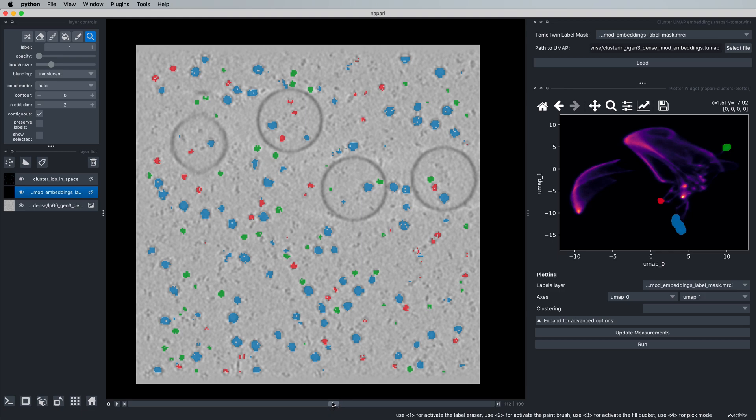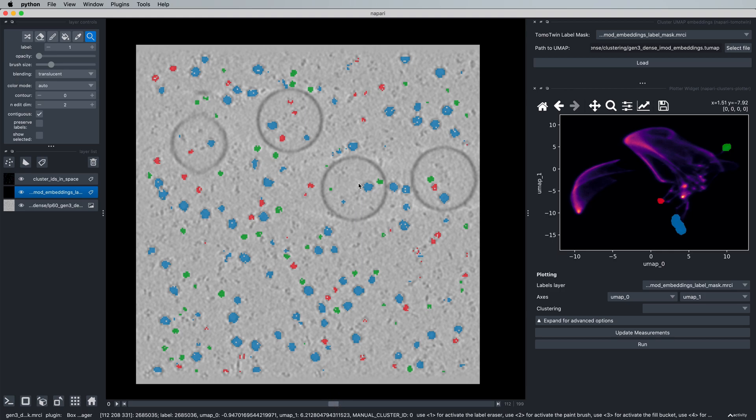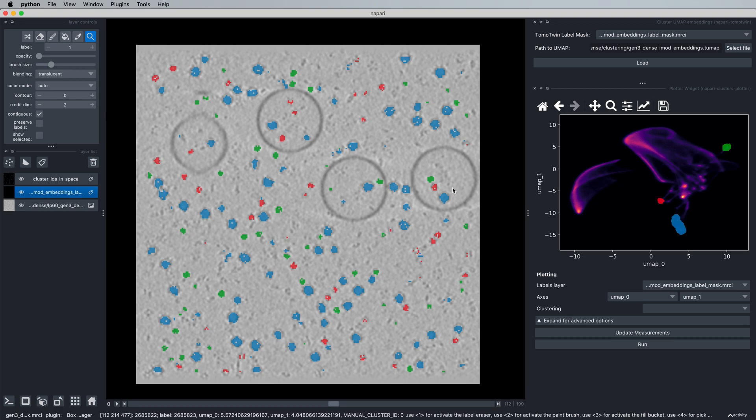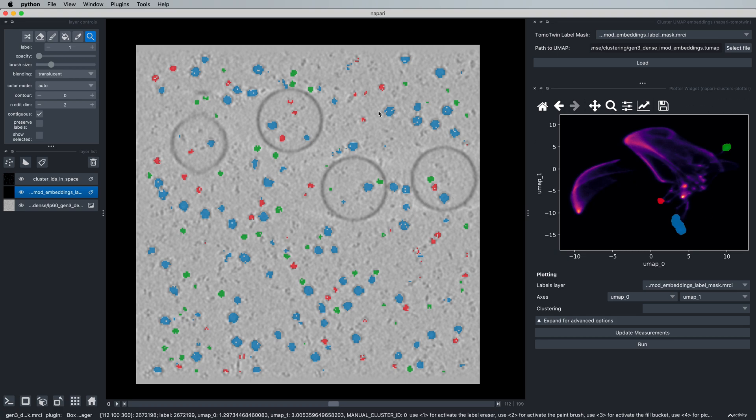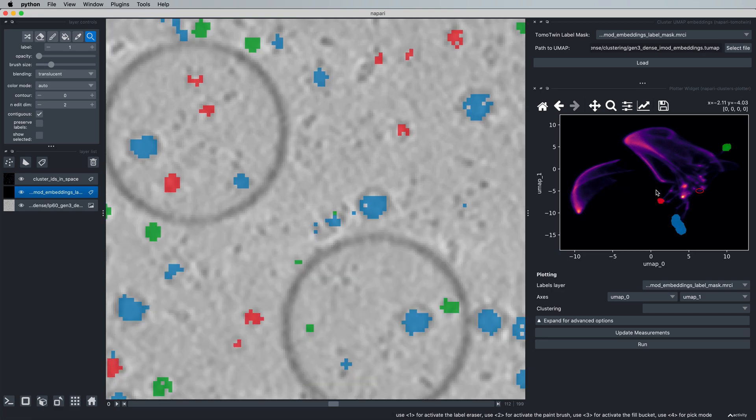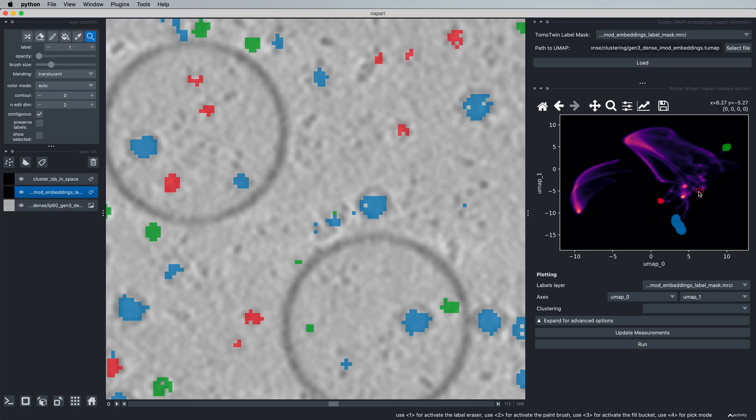Now another way we can use this tool if you have a particularly small protein or a protein with low copy number, or you're just having a hard time finding your protein of interest here in the embedding map, is that we can zoom in in our tomogram and simply click anywhere in the tomogram and see a red circle appear in the UMAP. And you see here that this doesn't quite appear to be somewhere on a cluster.